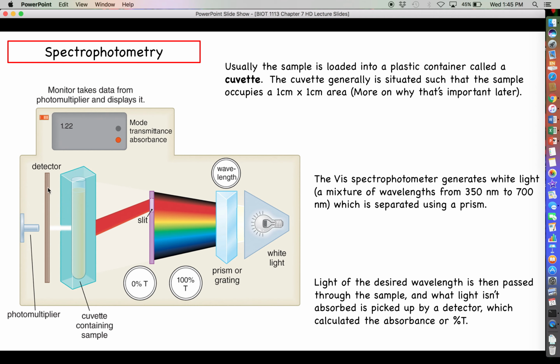So the idea in the case of Coomassie, which we might be looking at in this picture here, you can see we have a bunch of blue molecules here. This dye absorbs all the wavelengths of visible light except the blue wavelengths. Those get reflected back at our eyes, and because our eyes are being stimulated with visible light that corresponds to blue color, that's what we see. Therefore, the solution appears blue to us.